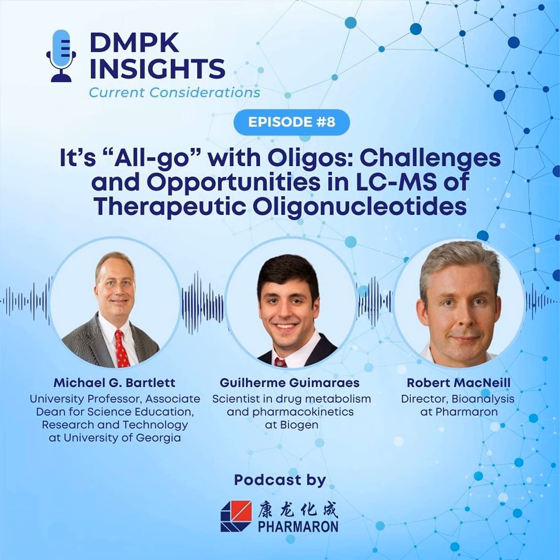Yeah, and not to mention too, from a DMPK perspective, if you're looking to outsource studies, depending on the CROs that you're looking for, generally people tend to be a little more reluctant with ion pairing methods. It can be slightly harder to outsource. You have system contamination, right? Oftentimes, in our field, in bioanalytical, we care about robustness, we care about throughput. So we like to dedicate entire instruments only to ion pair use. And so, I don't know, HILIC kind of comes to solve a lot of these issues, if you can implement it in the right way.